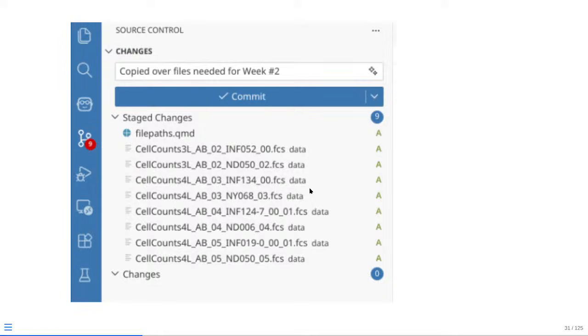This way, you're starting off fresh. You have all the data that you have now set up, all those project folders. You have now all those little folders within your project folder to keep things organized now set up. So at this point, this is a good stopping point as far as setting up a waypoint. In case you do need to revert back changes later on, you won't be losing too much effort as far as getting your initial project set up.